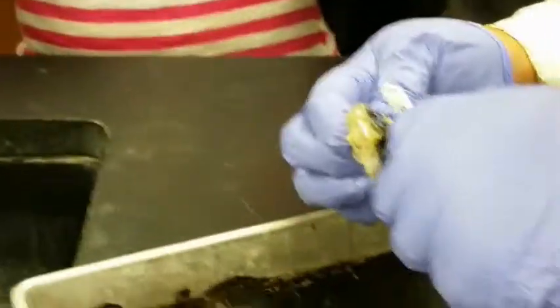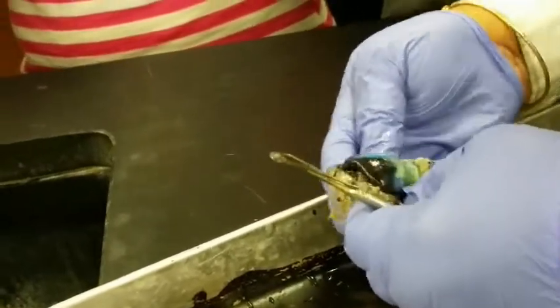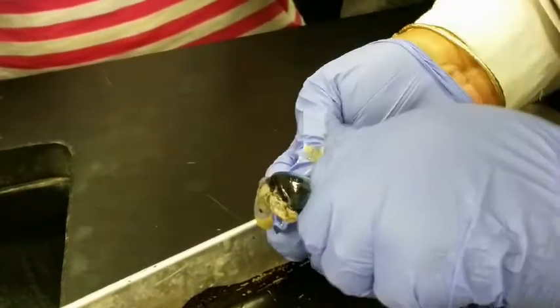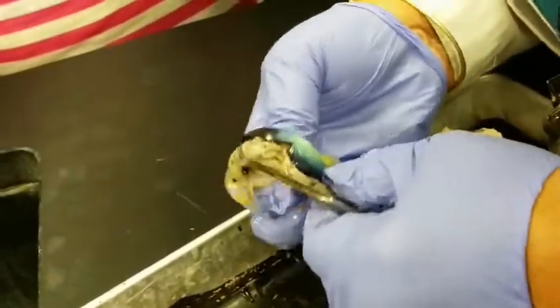So all of this is the jelly-like substance, which is the vitreous humor. Wow. And what is this beautiful thing that I'm looking at? The retina. That's the retina.